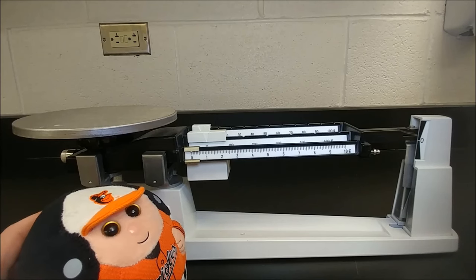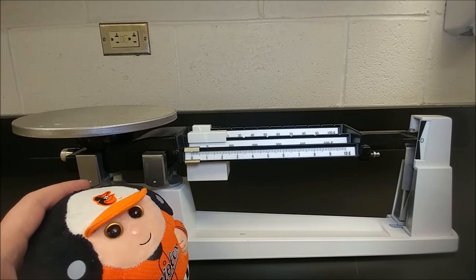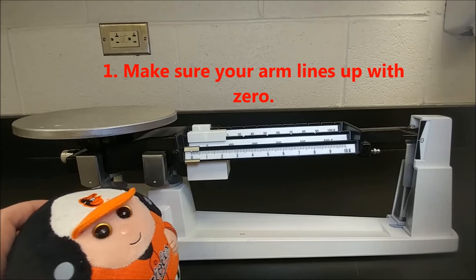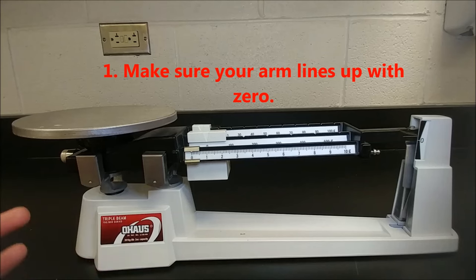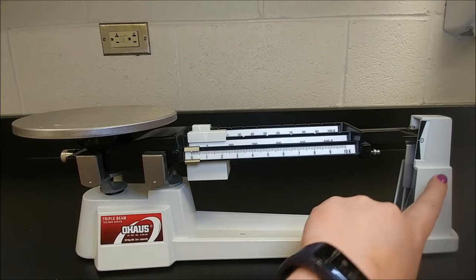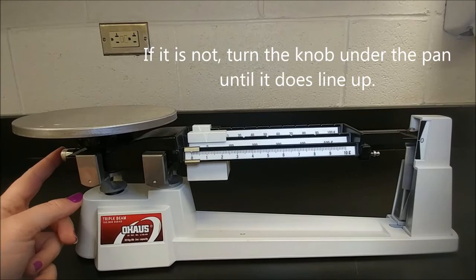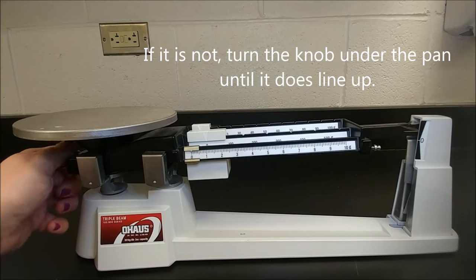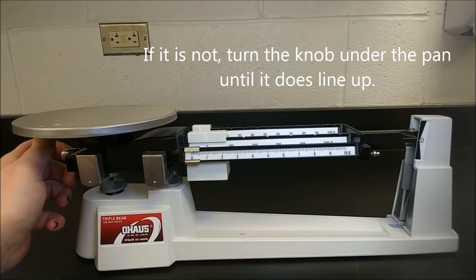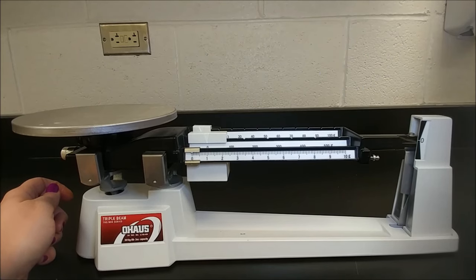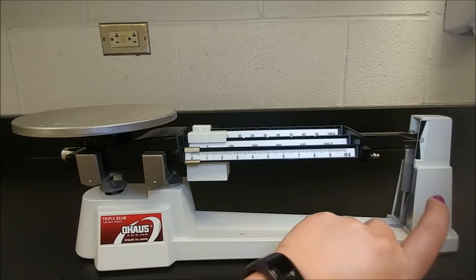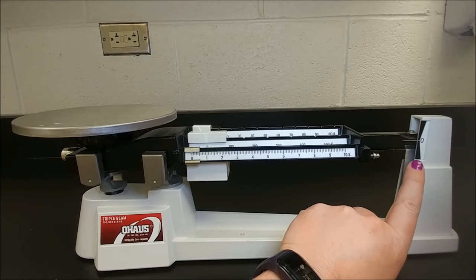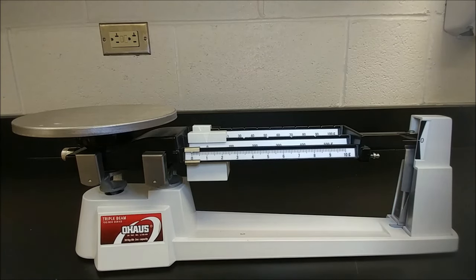To measure the amount of matter it has, we use a triple beam balance. First, we need to make sure that this line is lined up with the zero. This is known as zeroing. You can see that mine is not aligned, so I'm going to use the knob under the pan to get it to zero. Now the line on my arm and the zero are in a straight line. This is zeroed. It is officially measuring nothing.